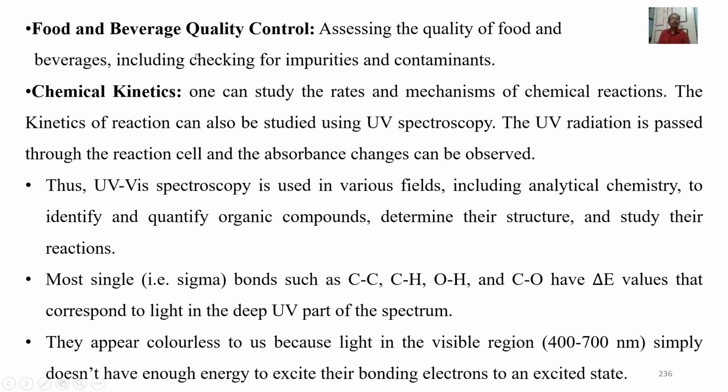Food and beverage quality control. Assessing the quality of food and beverages, including checking for impurities and contaminants. Chemical kinetics. One can study the rates and mechanisms of chemical reactions. The kinetics of reaction can also be studied using UV spectroscopy. The UV radiation is passed through the reactant cell and the absorption changes can be observed.